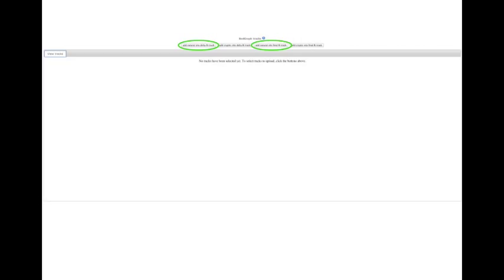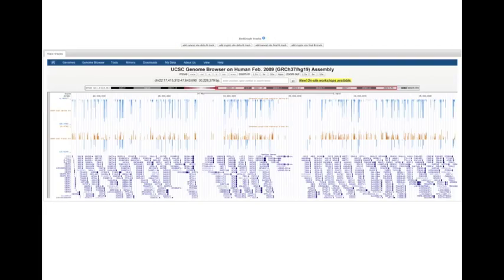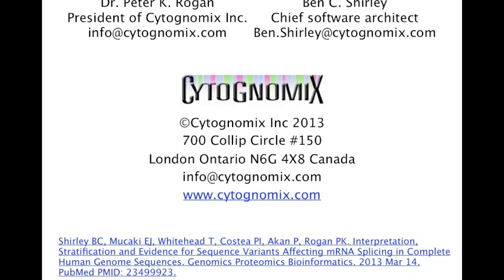The upload process may take a moment depending on how many variants we're dealing with. After the process is complete, the UCSC genome browser will be displayed. After navigating to a genomic coordinate of interest, the uploaded tracks as well as the built-in track ref gene will be visible. Orange bars indicate a splice site with increasing RI, while blue bars indicate decreasing RI.